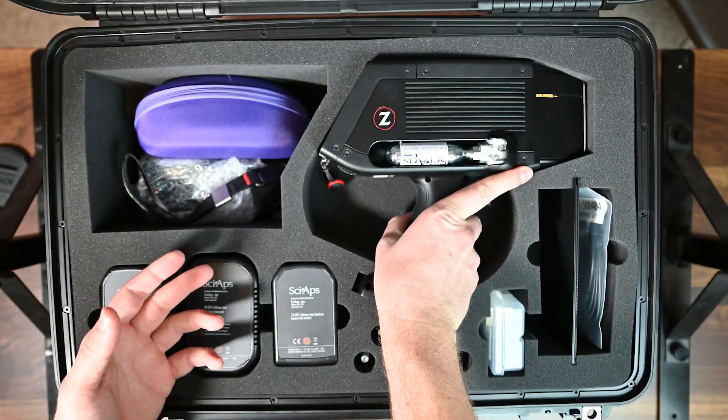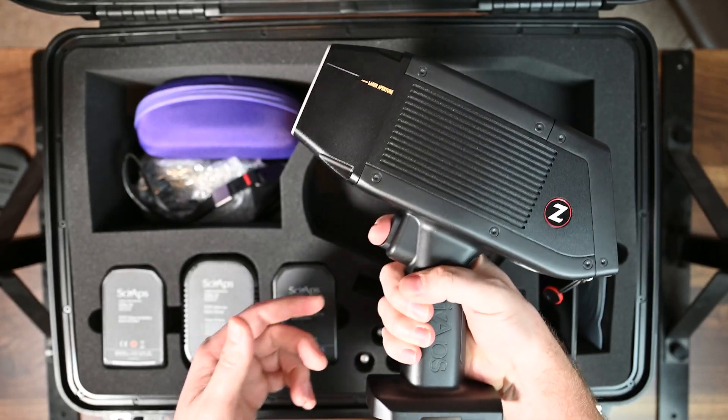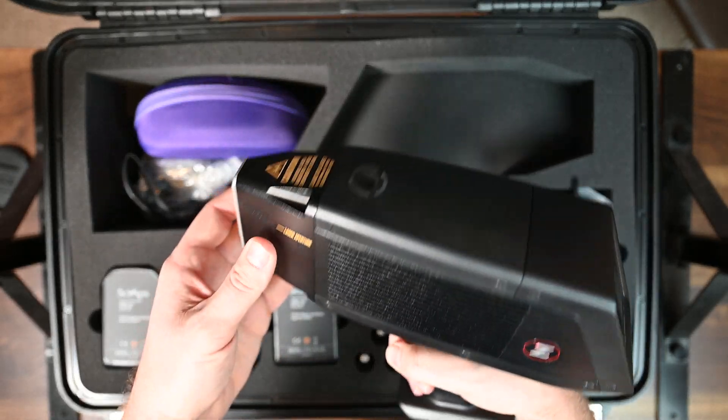LIBS stands for Laser Induced Breakdown Spectroscopy — it's similar to OES except it uses a laser. The analyzer itself feels good; it has a nice big trigger that feels really nice.